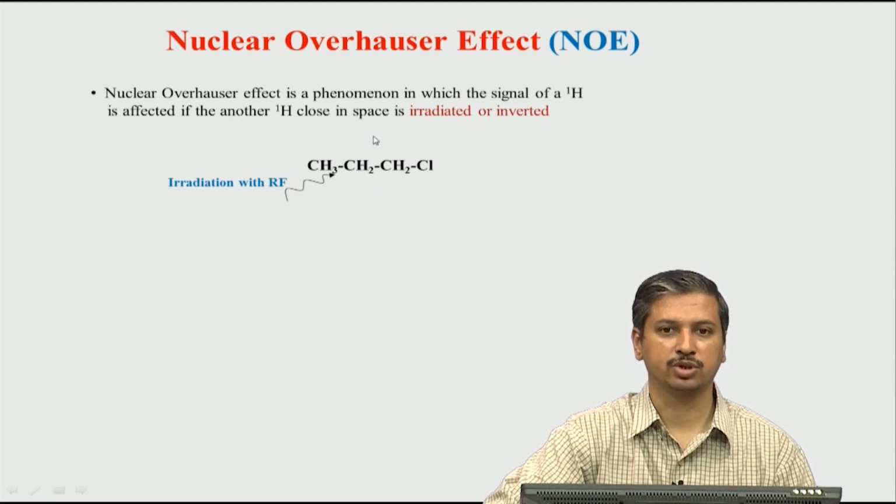These two dipoles can interact with each other through the mechanism known as dipolar coupling, and this interaction affects the population of one hydrogen when it is irradiated. So, if this hydrogen is irradiated, it affects all hydrogens which are neighbors to it in space. You have to remember the point, we are talking about through-space interaction, whereas those hydrogens which are far away are not affected. Okay.